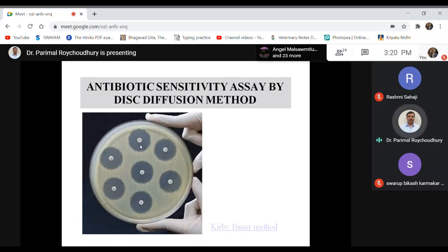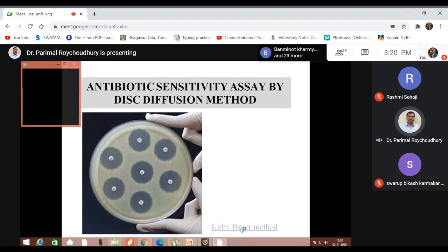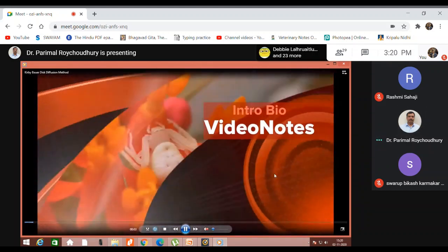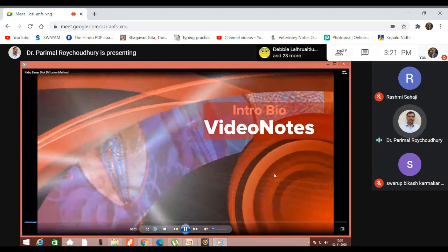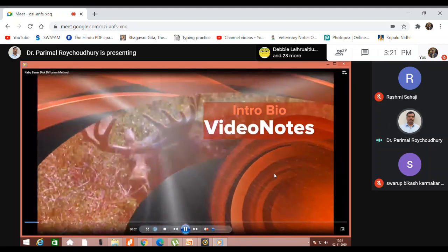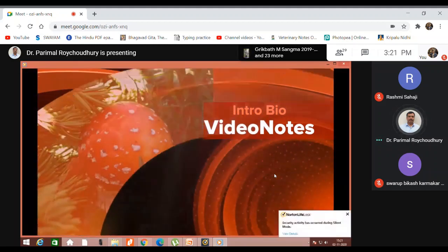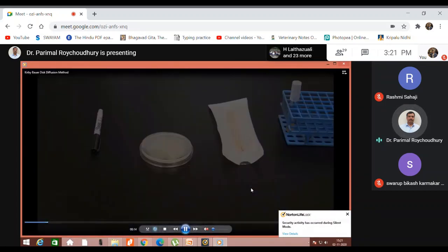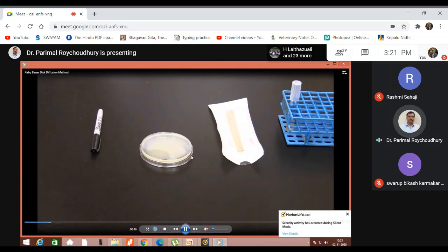So this is another practical. Always we give a demonstration to the students. Hopefully after your return we'll do it. So I just downloaded a small video from YouTube. Let us see, and this will be the last part of today's discussion. Here they will be describing how this diffusion method is performed.